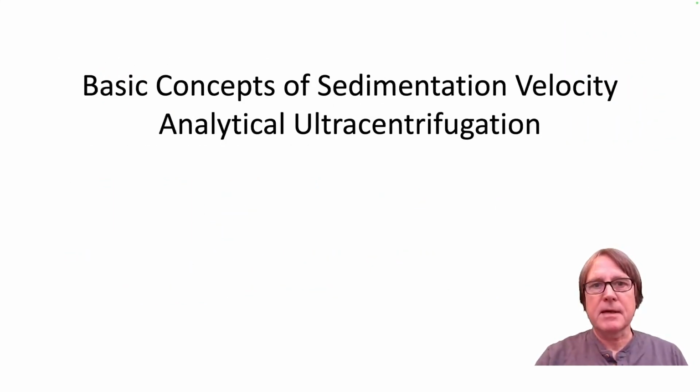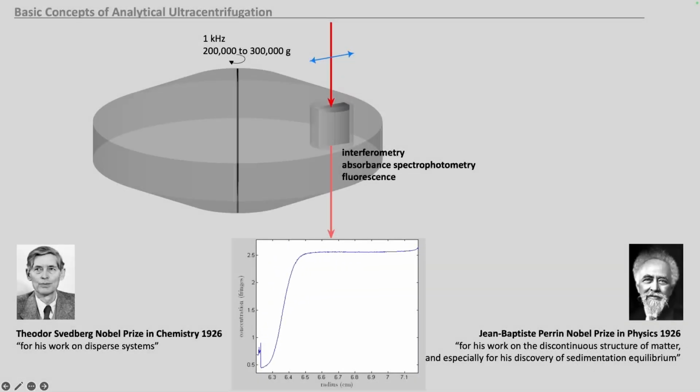So let's start by recapitulating the experimental setup of sedimentation velocity. In the experiment, we have a sample holder in the spinning rotor and optically measure the concentration distribution as it changes with time as a result of the applied centrifugal force disturbing the sample. And for interacting molecules, we almost always try to carry out the experiment such that there is chemical equilibrium at the start of the run.